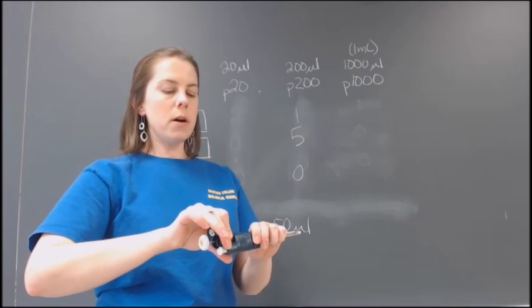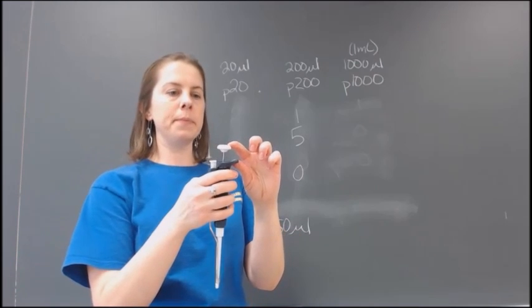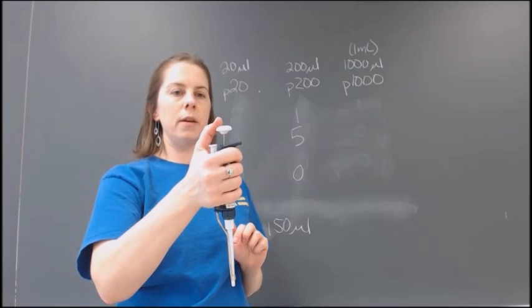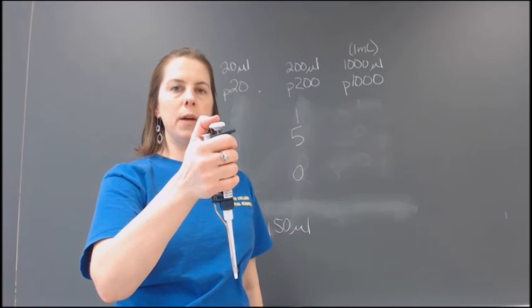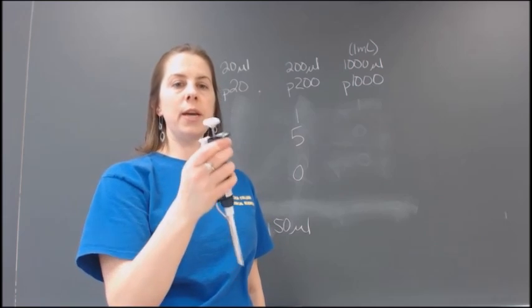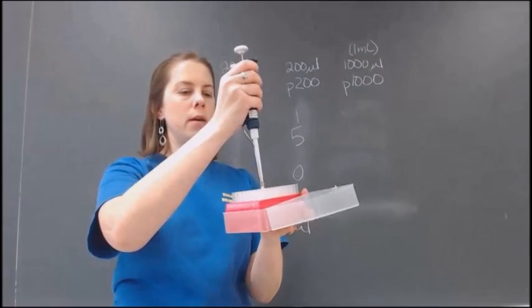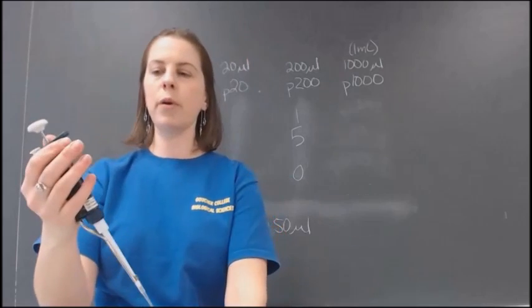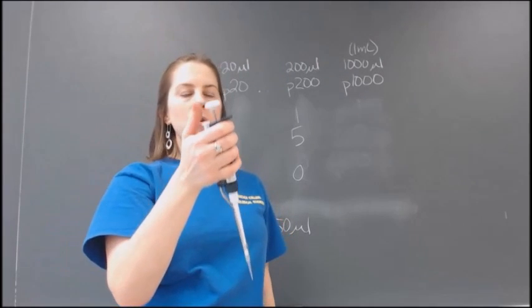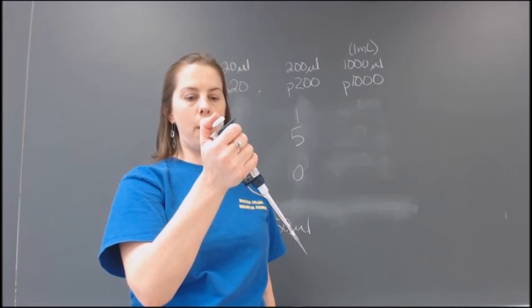There are what we call different stops with the plunger. If you press gently down, you'll feel it stop 1 time and you can press it past that. It's very important to understand what each of those stops does. So if we put a properly sized tip on our pipetter, in order to measure a volume, we want to push the plunger down to the first stop.